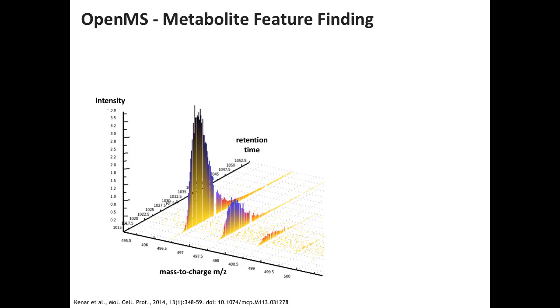What we wanted to avoid was this discretization in bins, because it didn't appear natural to me. Instead, when you look at these spectra, you see which of these peaks are aligned, but you don't have to discretize in specific bins. So instead, what we try to do first is a mass trace detection, and that is not based on any discretization. I'll show you how it works in a minute. That has a few other nice features. It tries to collect all the peaks that are in adjacent spectra, and it aborts once we are running out of the feature, and there are a couple of criteria to detect that.